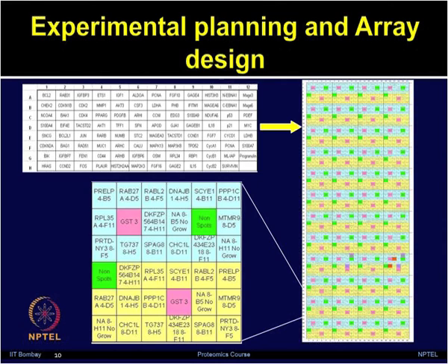Now, G12 similarly, like you have all the wells, defined genes are inserted there. Now, each one of these plates is only giving you 96 features. You need to have multiple blocks of 96 well plates. Then you need to transfer those into the 384 well plates, so that 4 of these plates can be transferred to one 384 well plate. And now, that 384 well plate and multiple 384 well plates are used for doing this printing.